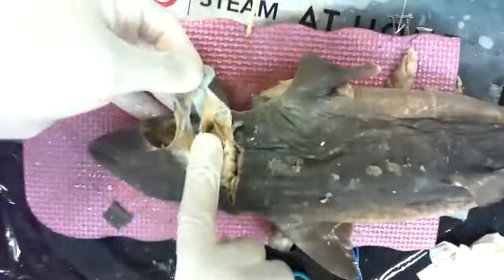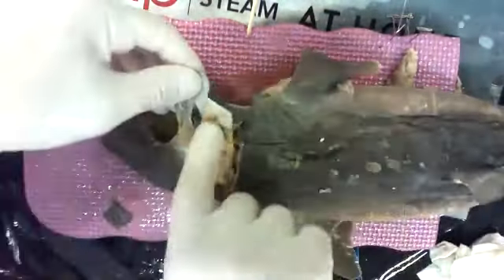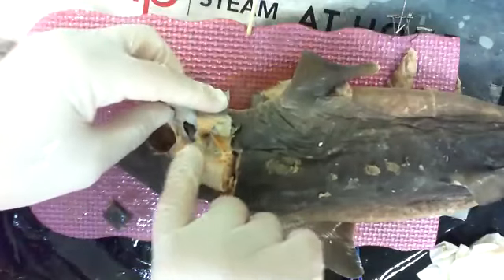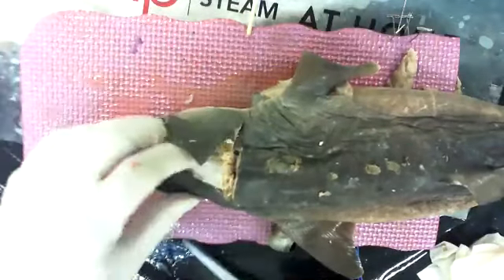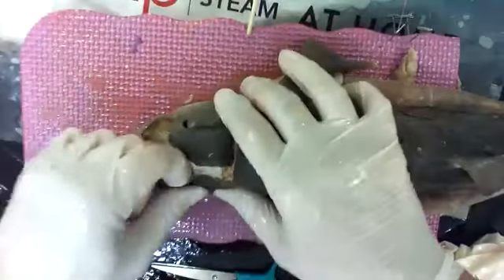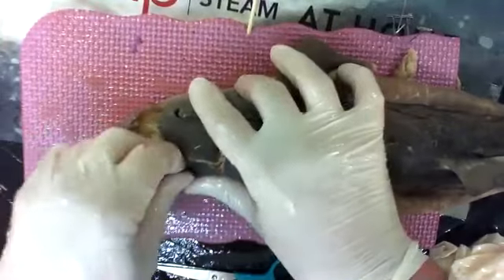You can see the muscles. It's when the shark winks. I'm kidding. Those muscles go down to the spiracle. And it looks like some of them go down to the jaw, so for helping control chewing, and it probably opens and closes the valve on the spiracle. Okay. Underneath that one, just taking my fingers in, pulling this back.